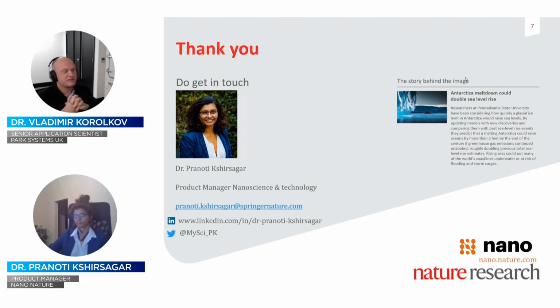Again, my usual answer: just give it a go, try. That's the best way you can do with any microscopic technique. Just give it a try, and it should work.